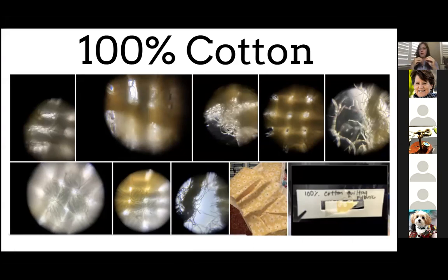So with this type of Foldscoping activity, kids are going to have fabrics at home that they can look at. You could bring fabrics into your classroom depending on whether you're going to be face-to-face or distance learning. Some of these Foldscope ideas are simple and easy, but yet connect to such broader issues in our world.